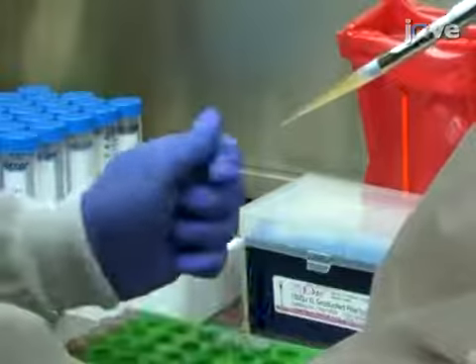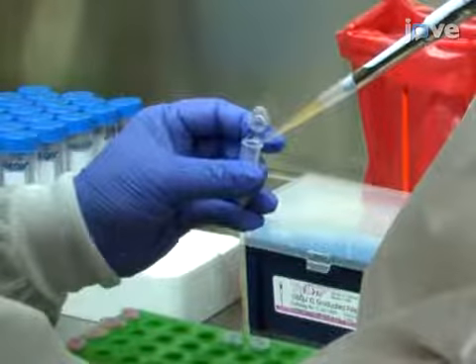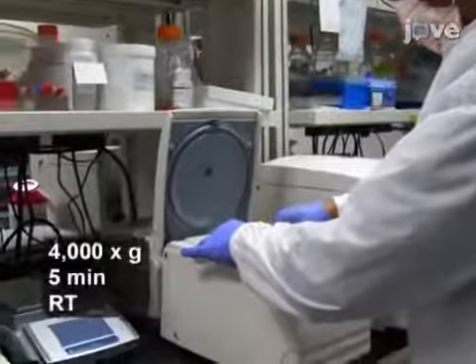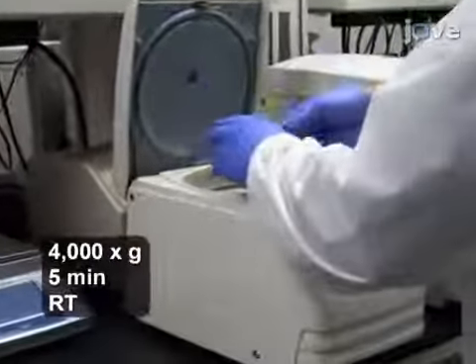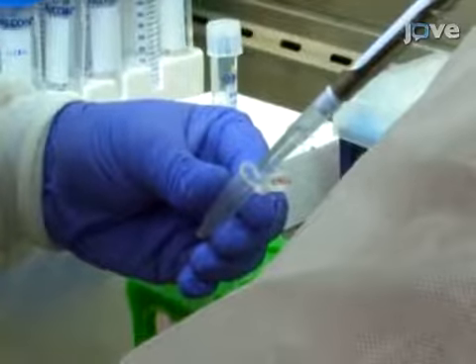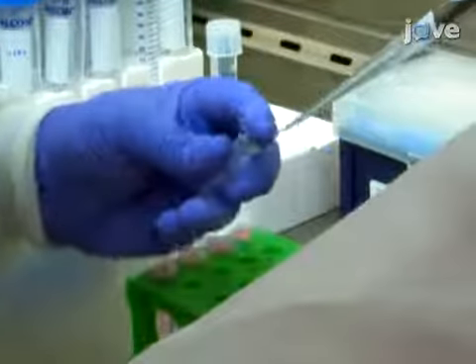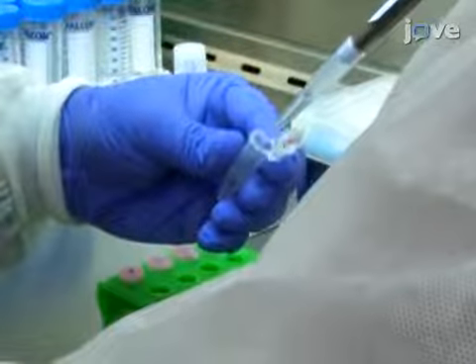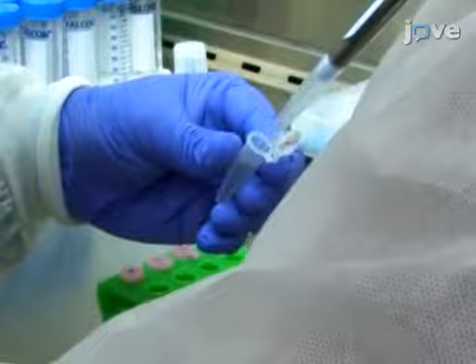Then, in a microcentrifuge tube, add 1 milliliter of the broth. Spin the mix down at 4,000 Gs for 5 minutes at room temperature. Then, discard the supernatant and resuspend the pellet in 1 milliliter of PBS. Repeat this wash step one more time.